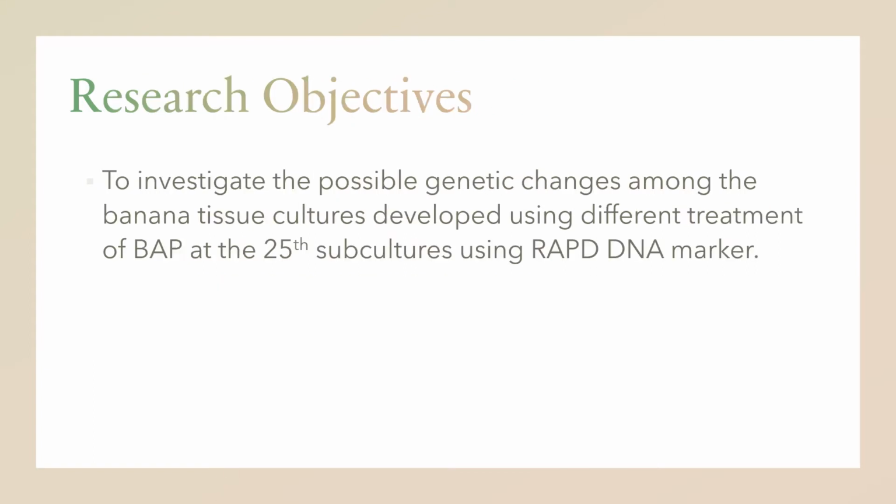So just to recap and restate the research objective: for this experiment, the research objective is to investigate the possible genetic change among the banana tissue cultures developed using different treatments of BAP at the 25th subculture using the RAPD DNA marker.